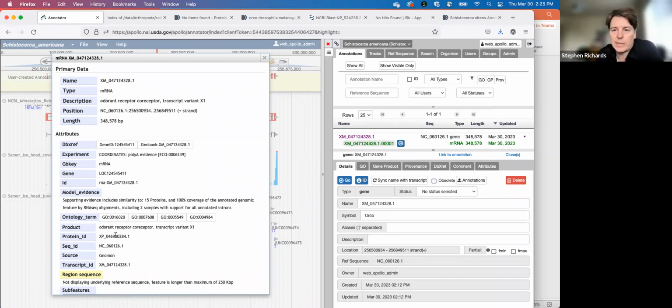And as Ho-Jun said earlier, we've got a bunch of unknown genes with differential expression based on phase. And so you could call them swarming phase genes, right? In a paper later on, but that's probably not quite enough. Yeah. I'll show you some results later on that show that no, you can't. Okay, so we'll let Monica get back to this.